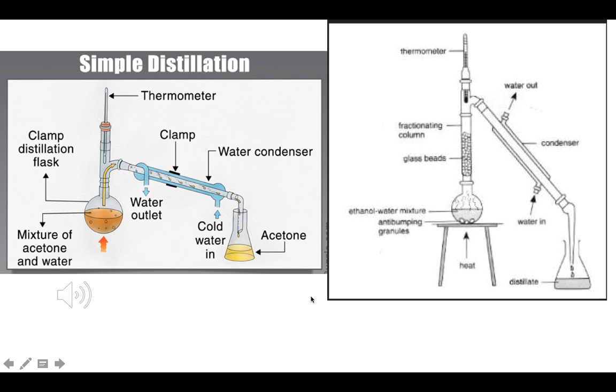I'm going to talk a little about distillation. Distillation is generally a concept that focuses on separating two components of a mixture. This is achieved by separating them by phases. Distillation is used to remove one liquid from another liquid by changing it to a gas phase, then making it into a liquid again. It takes advantage of differences in boiling points. The more volatile component is converted into a gas. Volatile means the one that evaporates faster from liquid.